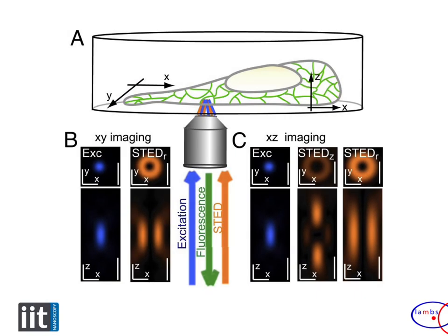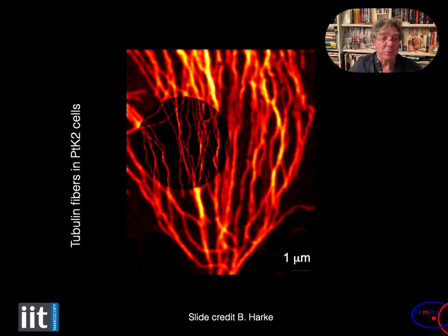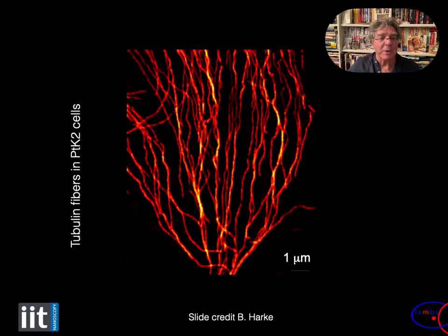Well, come on, you can play this game. The blue beam, that is a conventional brush, plus the power of a second beam into the cell. Yes, this is what you can do. And you can select not only by scanning, but also scanning with a second beam, the regions you are interested in for getting a super resolved image.